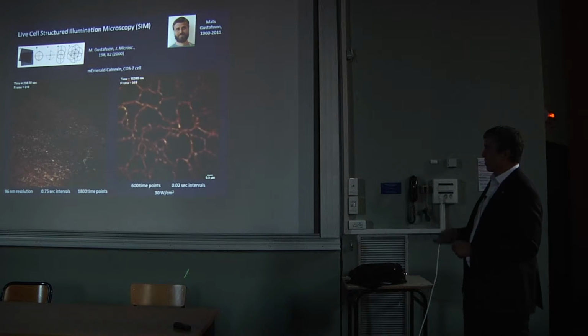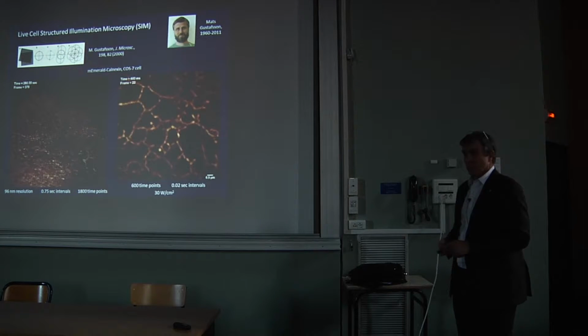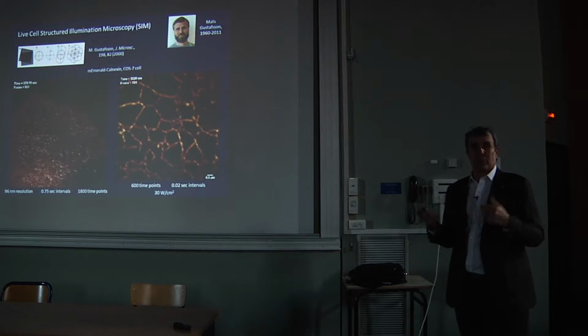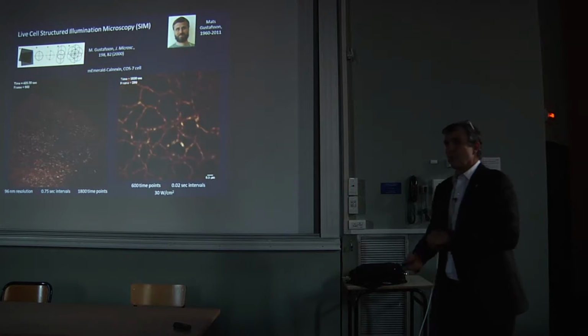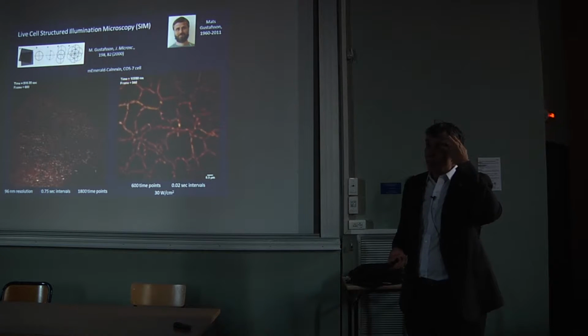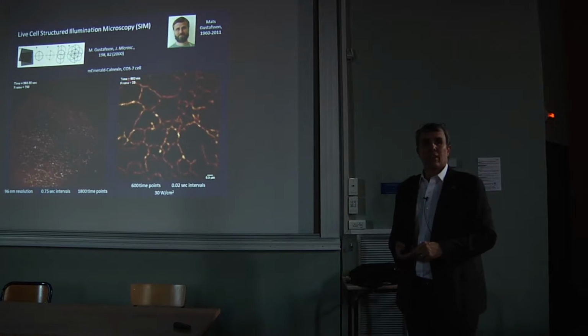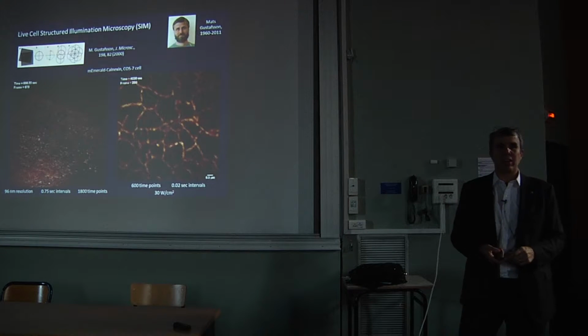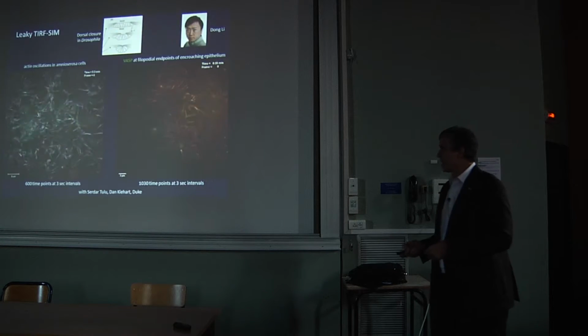In this case, it's a zoom in of the ER showing for 600 time points at 50 frames a second what's going on. What you learn after a while in developing these techniques is the cell is a crazily dynamic place. And we really need these dynamic tools to be able to understand how all of this goes on.